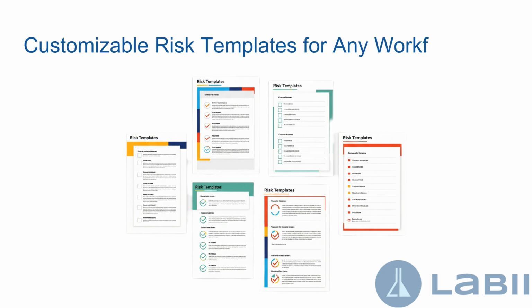Customizable risk templates for any workflow. Choose from pre-built templates or create your own risk models with configurable matrices, thresholds, categories, and evaluation rules. Labii's modular system aligns with your SOPs and quality system requirements.